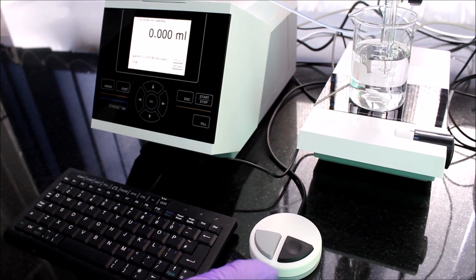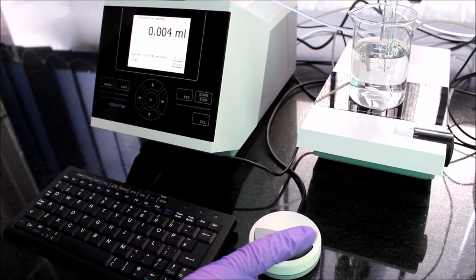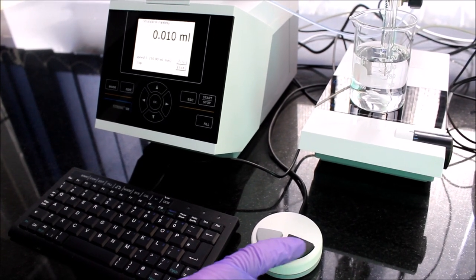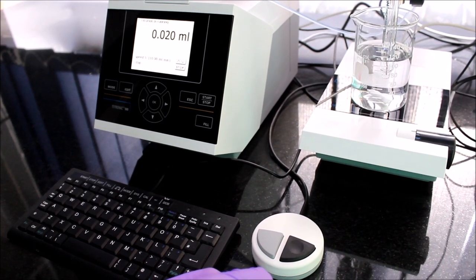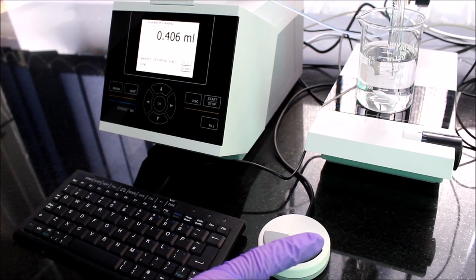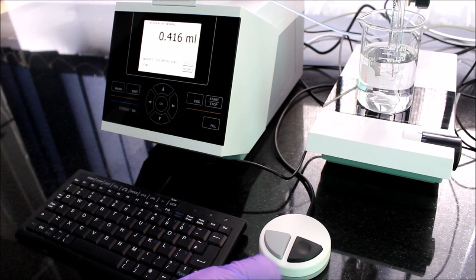So now when I lightly press the right button once, the machine always delivers 0.01 milliliters of titrant solution. If I click firmly, the delivering process becomes continuous. The button has two resistance points at which the speed of delivery increases.